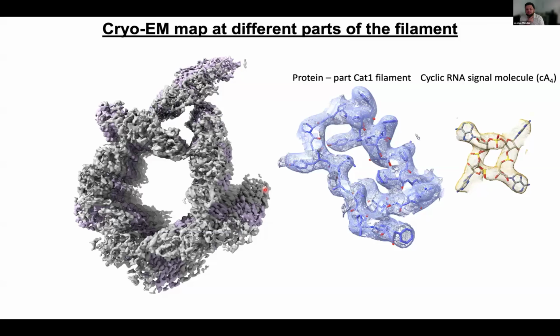Just to add to the discussion that you are having. Often what I've seen is when you have a twist like this, like a turn on the filaments, because I've processed filament data with CryoSPARC, I've seen when they have a slight turn like this, they find it very difficult to align. One way to handle that is tau filtering, or some filtering that will specifically disregard filaments when they tend to have this twist, like a C. You most often see that in your 2D classes. Oh, yeah. So that's why probably Topaz works, because it comes in with no bias.